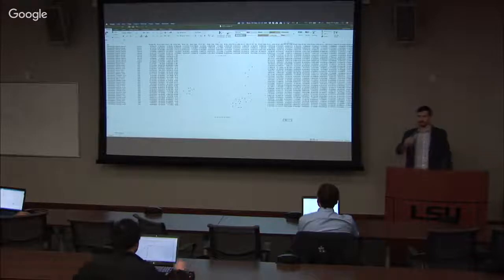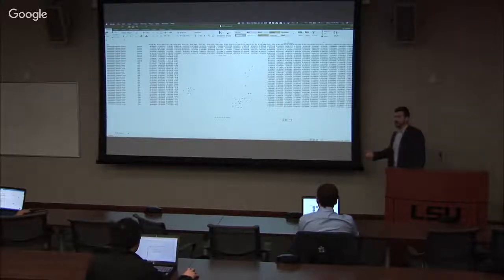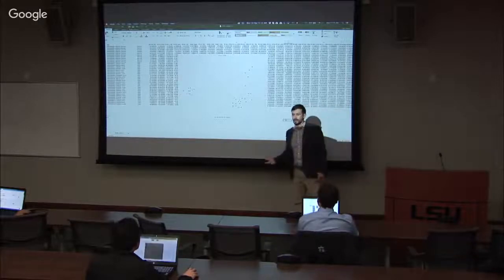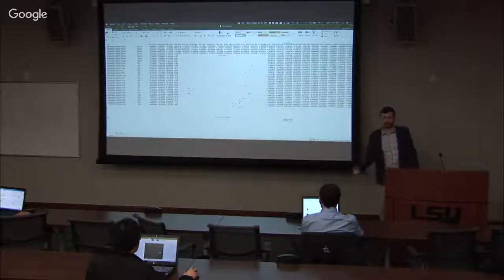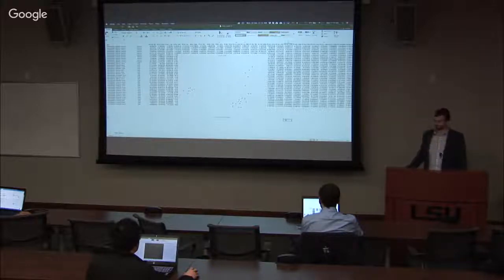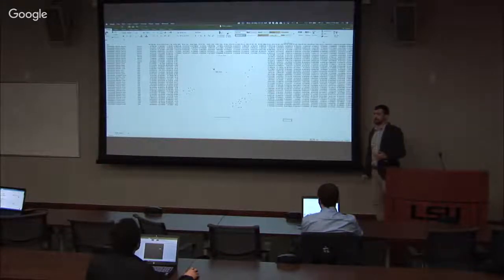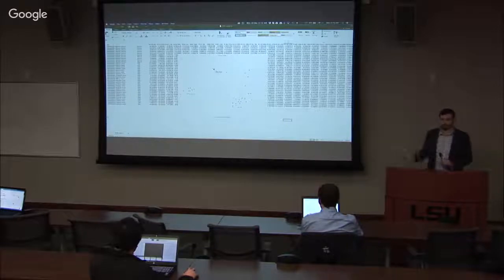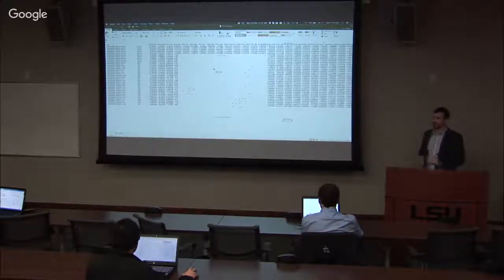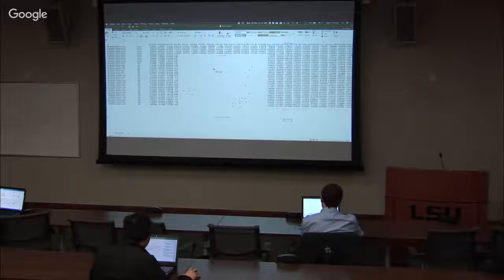Did everybody get the same thing? So biologically speaking, it's much more reasonable to expect the normal tissue to be different from the cancer tissue in a more significant way than to have one portion of the DCIS be more different than everything else. And so I think this is a good example of how working with your data, transforming it to logarithmic scale, filtering for the noisy part, and then using methods like quantile normalization can help you get more biologically interpretable results.